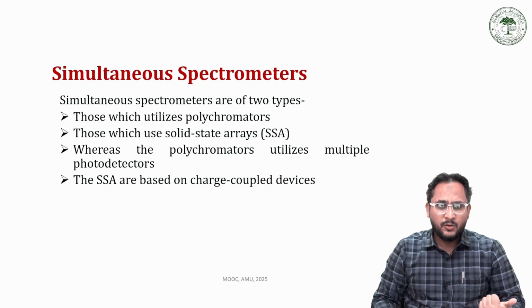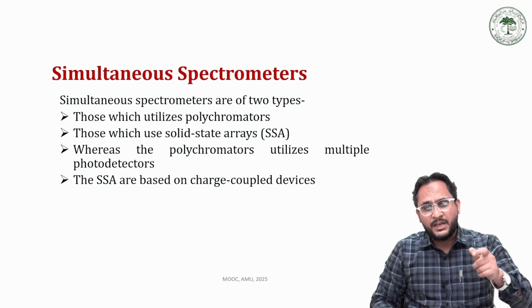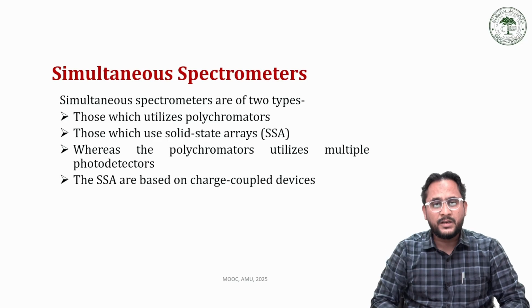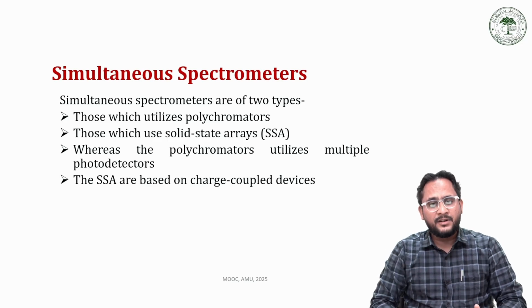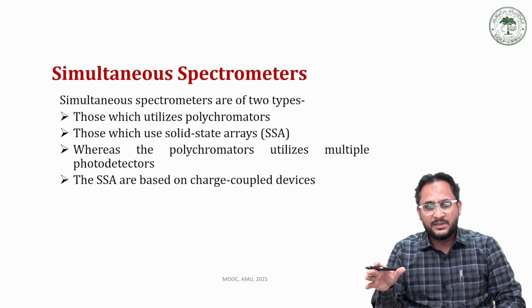While in case of the old version of these spectrometers, which are called the sequential spectrometers, we have to every time adjust the grating, so as to select different wavelengths and different light radiations in order to determine or detect all the elements present in the sample.